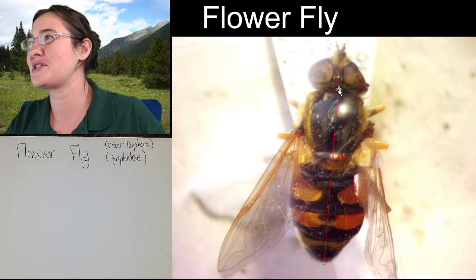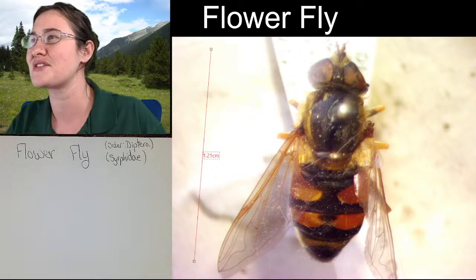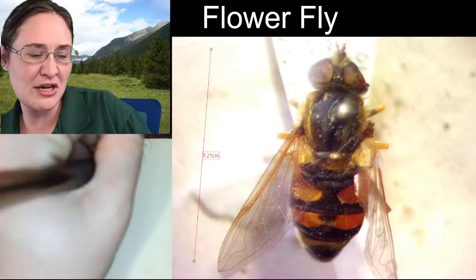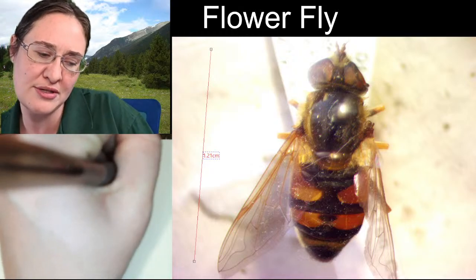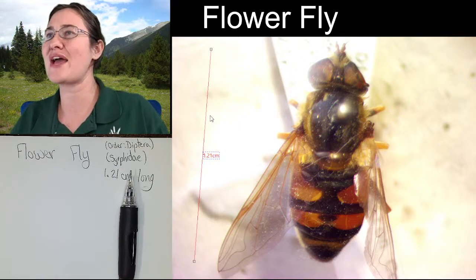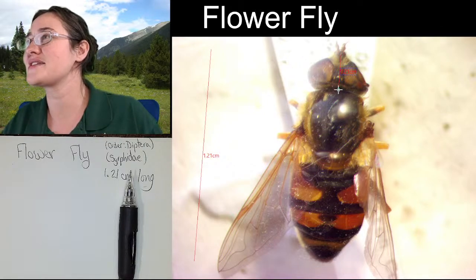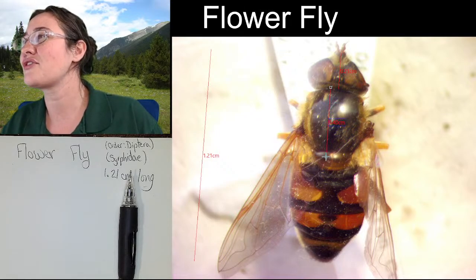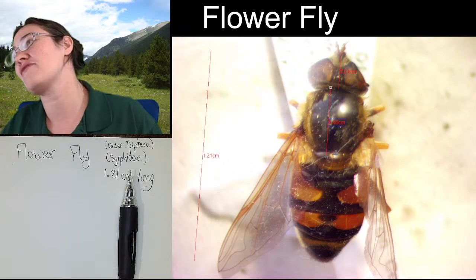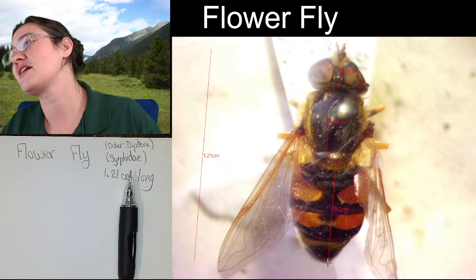Oh, and I had my measurement in inches for my kiddos. So let me switch this over to centimeters. Aha! So our specimen is 1.21 centimeters long. And while we're in here, so that's the total measurement is 1.21. I might as well give us, let's see, the head is 0.21. The thorax is 0.4. And the abdomen looks like 0.6-ish.